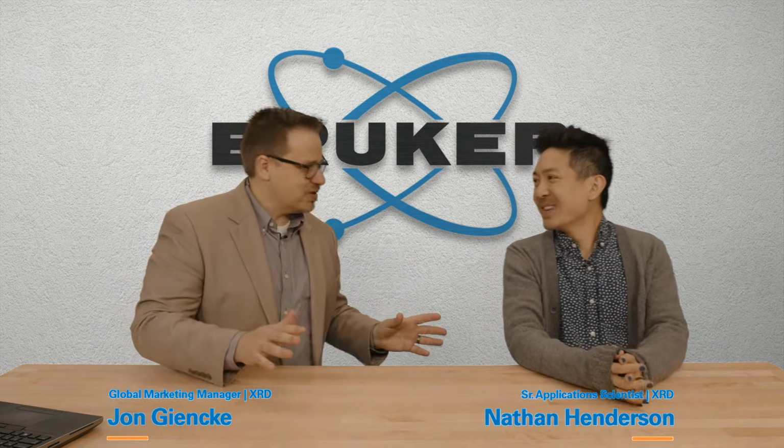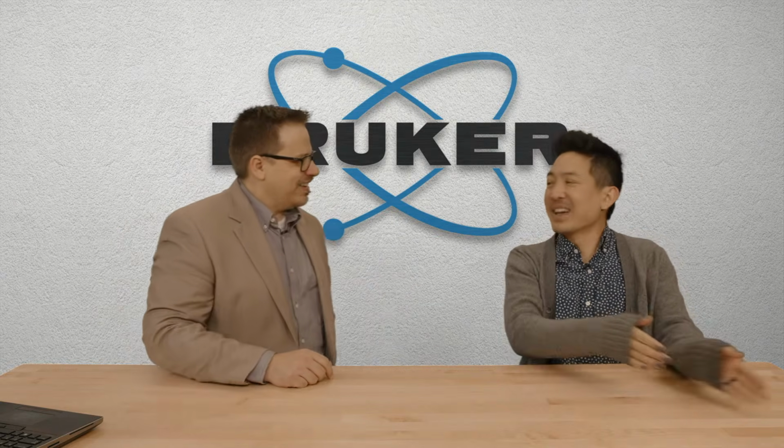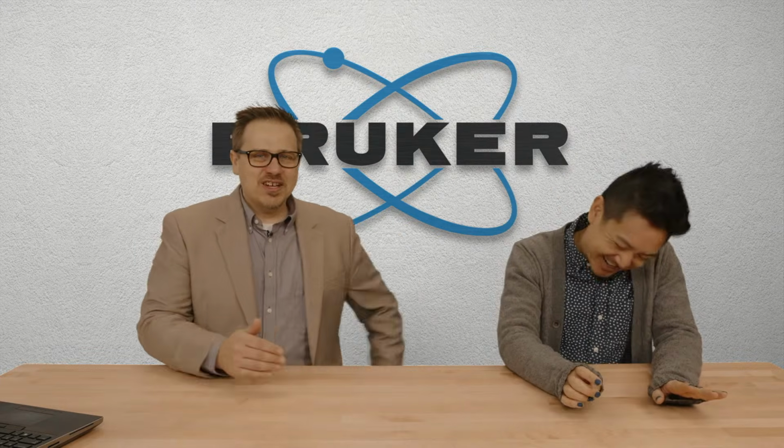So this wiggly line. We do have a lot of video content, so if anybody wonders, what is XRD? There you go, you can get it. But just real quick, you have these peaks and they're at certain places. What does that mean? Yeah, what makes this different from any other analytical technique with another random wiggly line? So what are the positions?